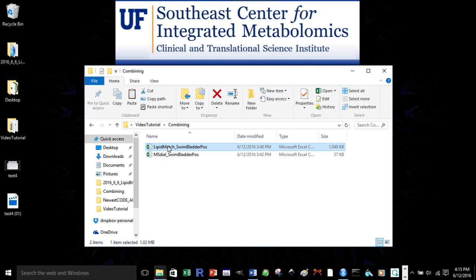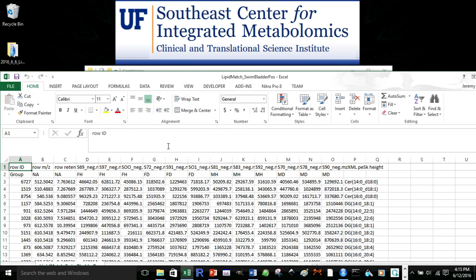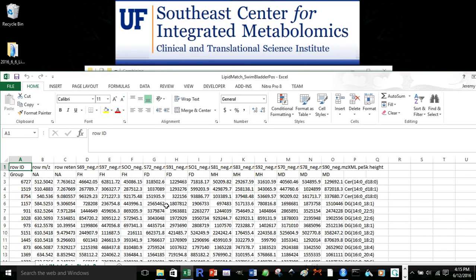So if we look at the LipidMatch feature table, you can see that we have our identifications, our groups, and our samples, as well as their peak heights.